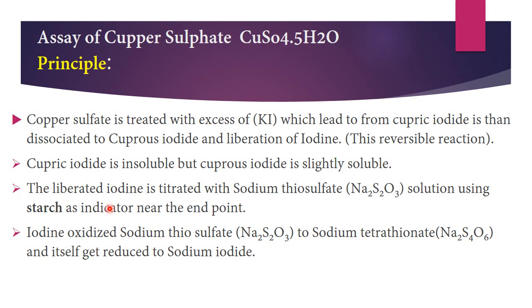The liberated iodine is titrated with a sodium thiosulfate solution using starch as indicator. إذا التايتريشن سيكون بين liberated iodine المتحرر مع standard solution of Na2S2O3 in the presence of indicator اللي هو الستارش. هسه لهنا راح نفهم إنه this titration is the iodometric titration.